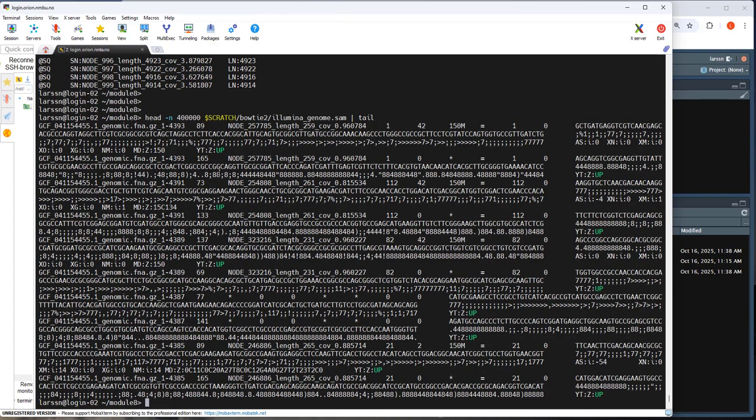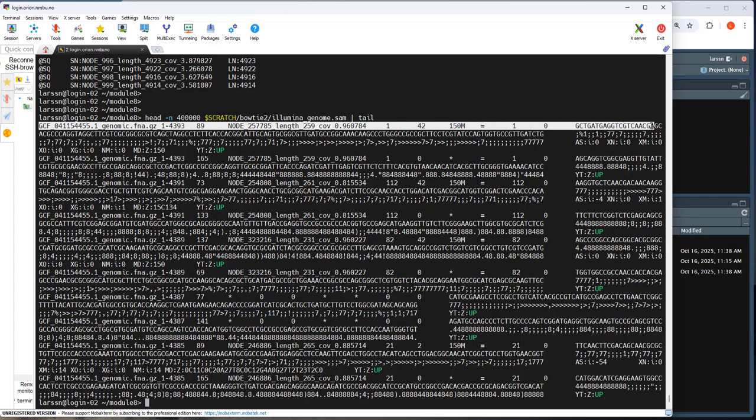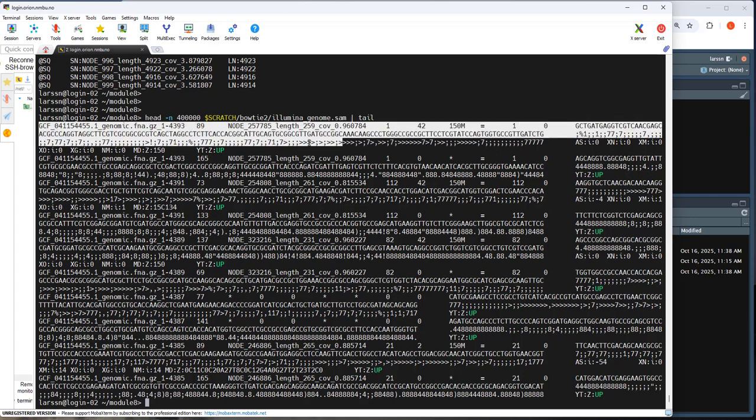And here you can see, that's what I was looking for actually, the SAM format, the SAM file. It's actually a big table once you start to see the columns. And it has, I think it's 11, here it is, first row actually.